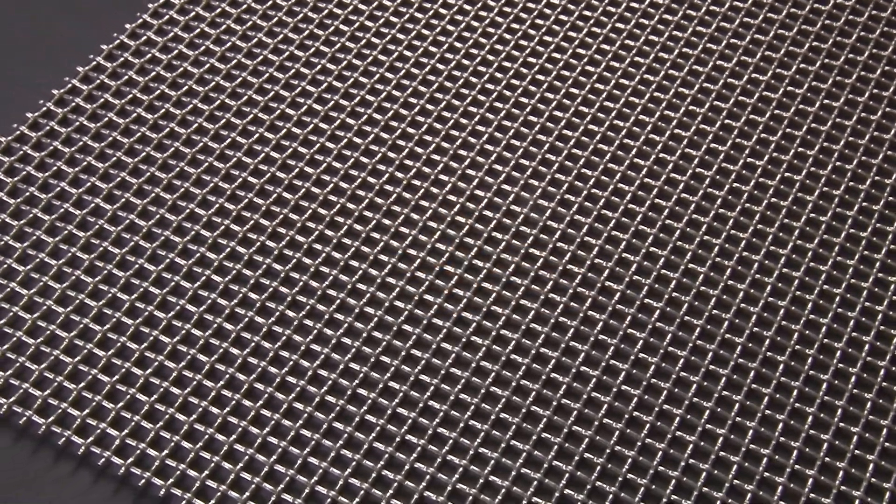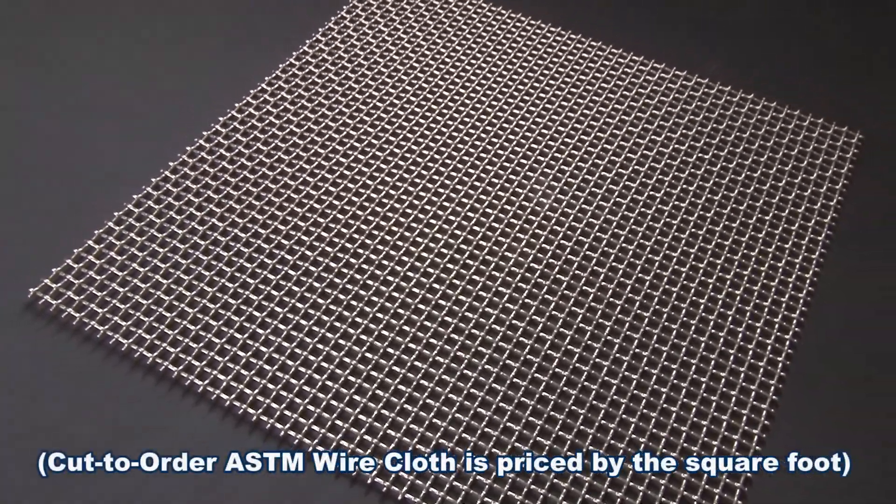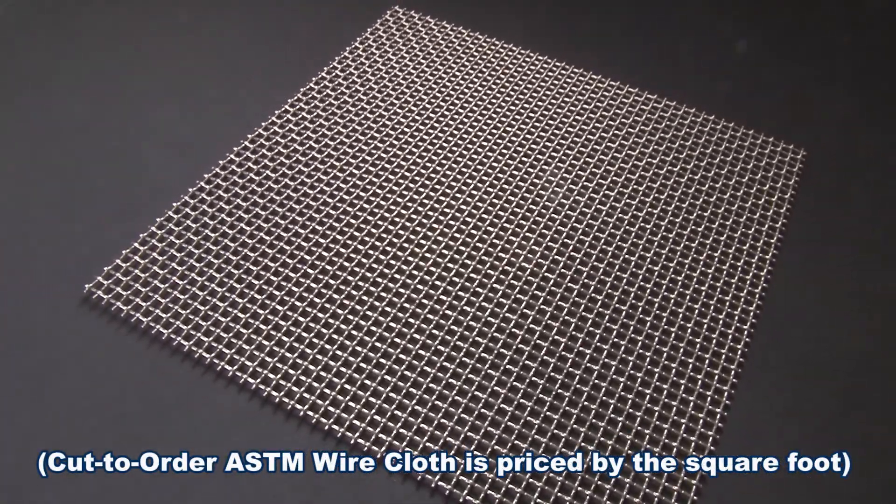Gilson can cut to order your ASTM woven wire cloth to specified dimensions in square or rectangular shapes for your unique particle sizing applications.